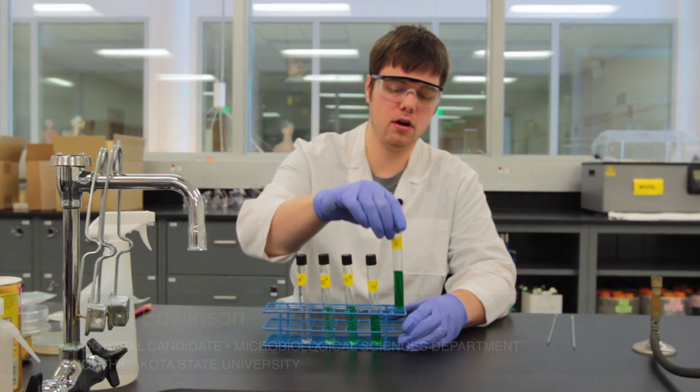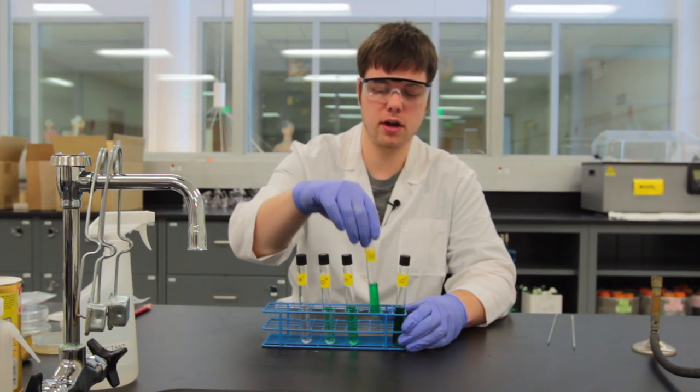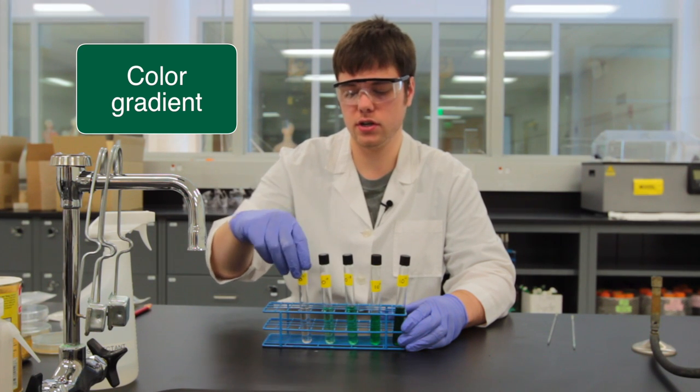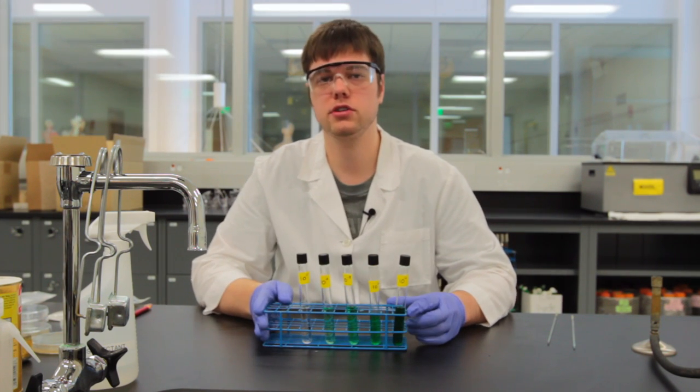So we've made our dilution series, we've got our 10 to the negative 1 all the way down to the 10 to the negative 5. Notice how as we go down our dilution series, the color starts to get weaker and weaker, which is good, meaning that we've made our dilution series correctly.